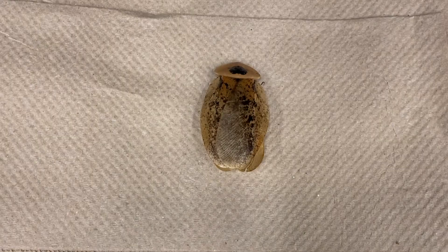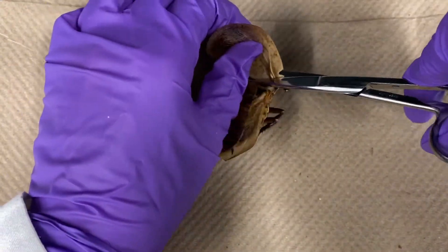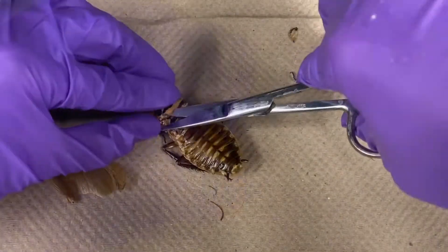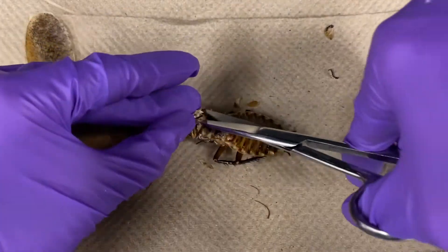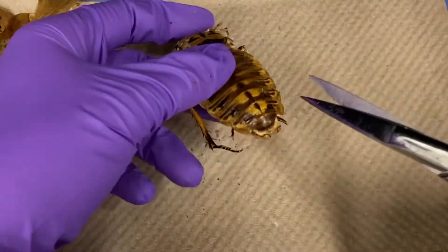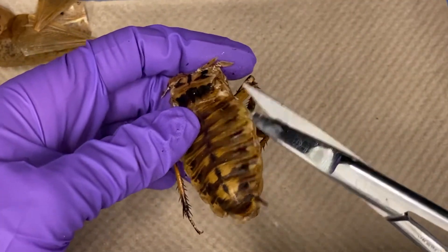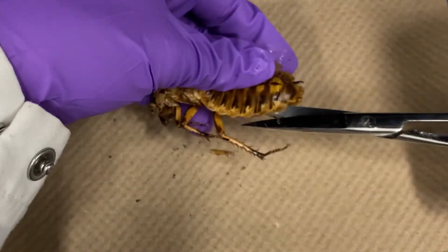To prepare for dissection, place the cockroach dorsal side up. Using scissors, cut off the elytra and wings close to their bases. Cut the pronotum away from the neck. Insert your scissors between the last abdominal segment and cut towards the head along the side of the exoskeleton. Do this along both sides.